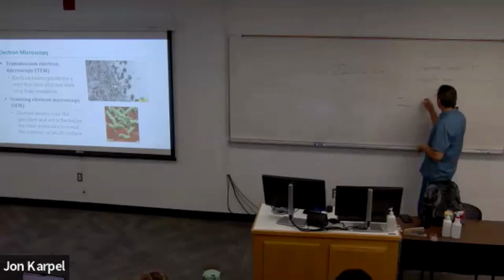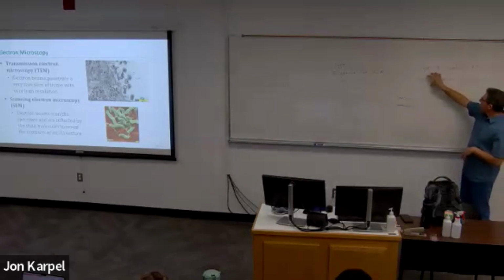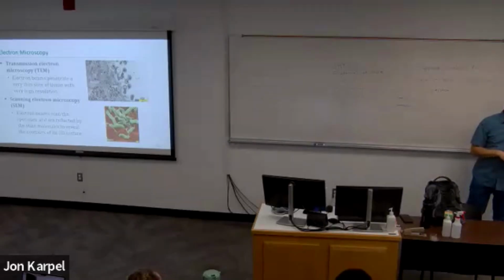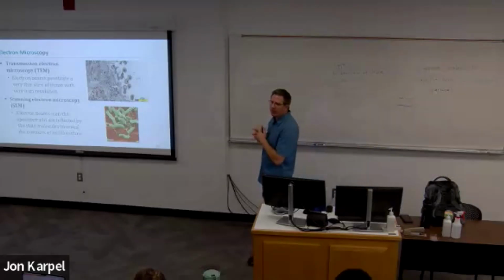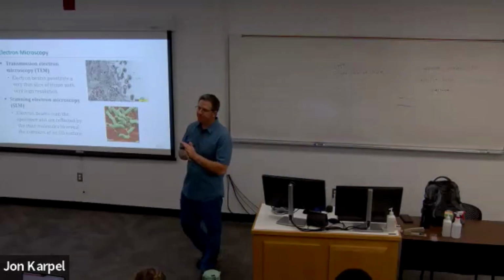So from lab, you'll learn the parts of the microscope. You'll know what eyepieces are and objective lenses. So they could show up on a test, but it's really not going to be an emphasis for the lecture.